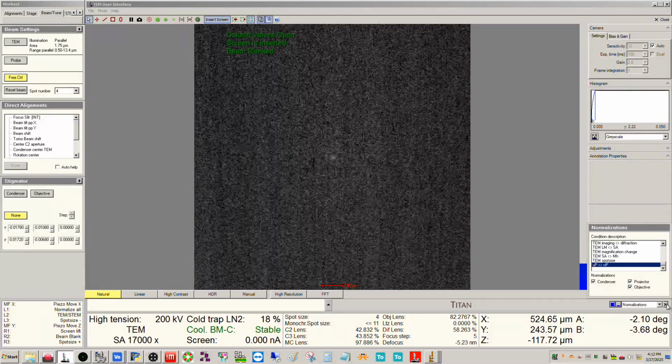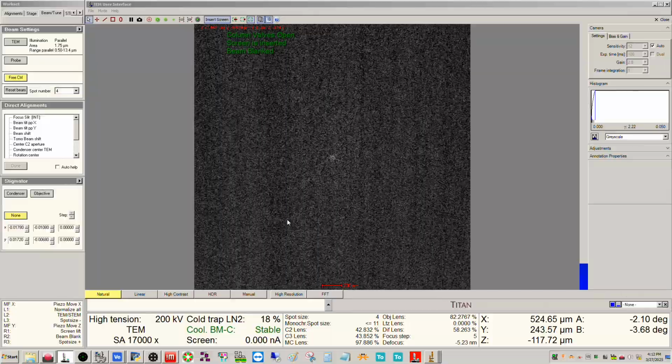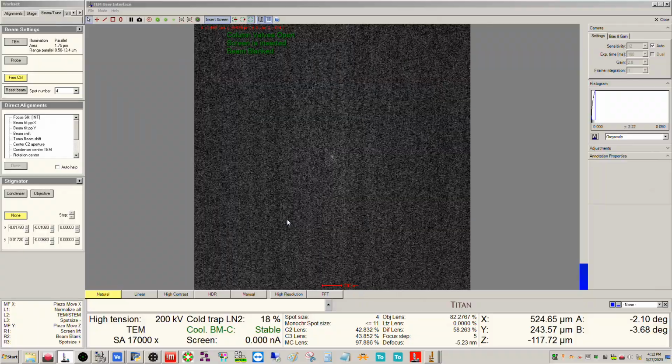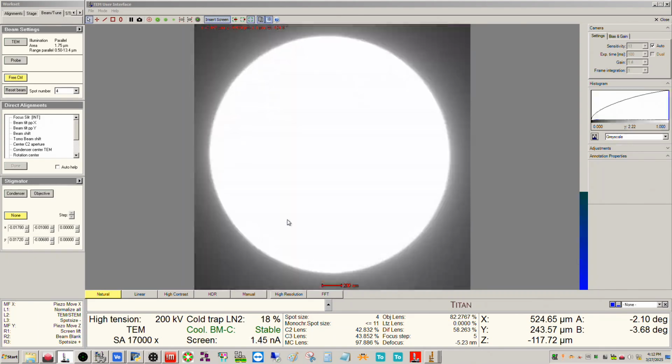There is also a way to manually tell the system to run a normalization, even though you're not actually changing the state of the microscope, okay? So let me go ahead and unblank the beam here. So you can see down here, I have my L1 button set to normalize all, okay? So you can set one of your L123, R123 to do this, okay?